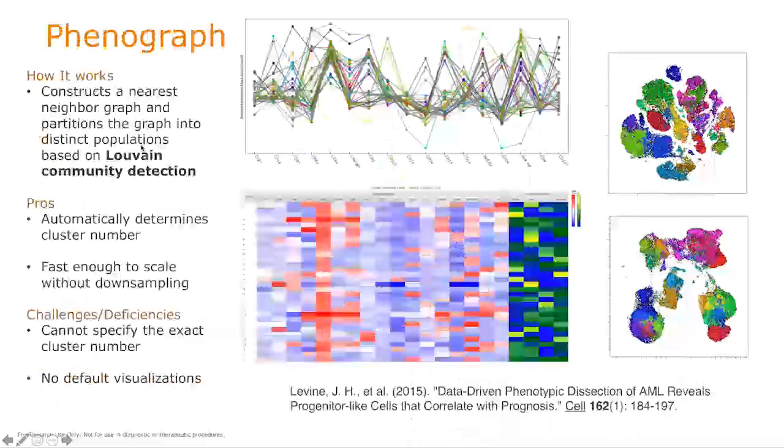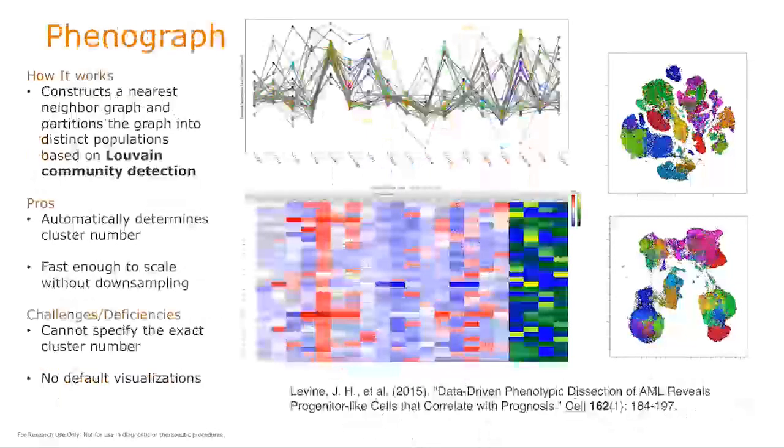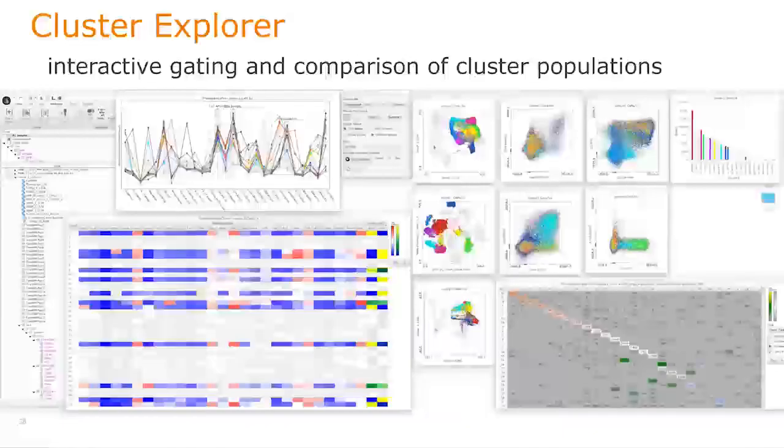So I can't go down into the weeds that far for you and give you the answer here, but I can say that I like Phenograph, even though it's slow, for what it produces. I like FlowSOM because of the visualizations and its speed. And I like X-Shift because you can just download the jar. You don't have to set anything else up, and it just works on your data. Right now I'm still in the process of deciding which one I would use if I were to move forward with just one. It would depend on how much data I have to cluster, how complex the data is, and whether I have the heart and the time to compare these different methods to each other, which would be the ideal situation, as you run all three.